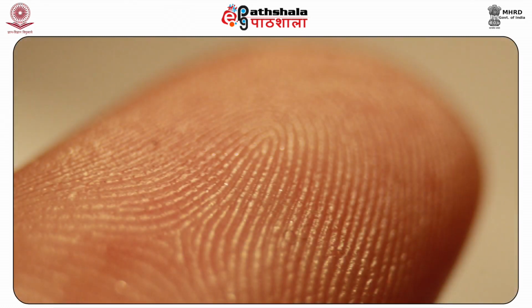The composition tags the fatty acid and lipid components of sweat residue for visualizing fingerprints.